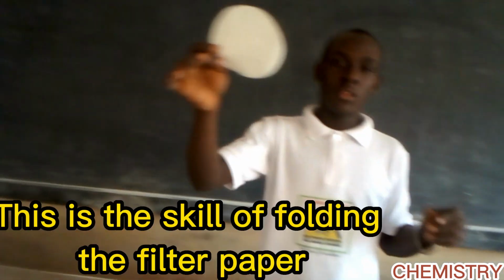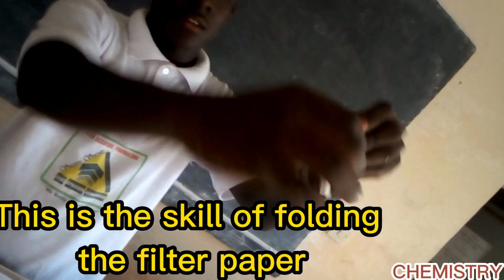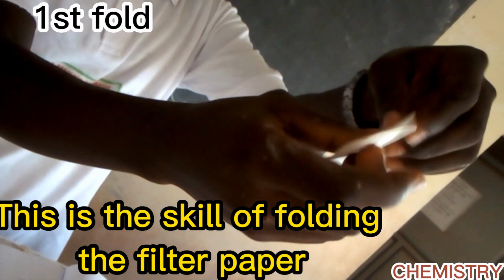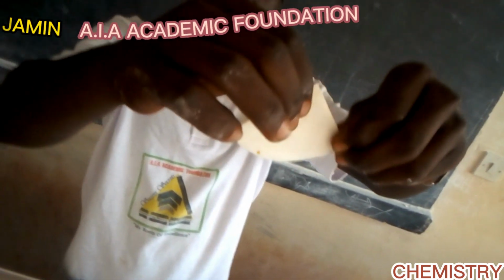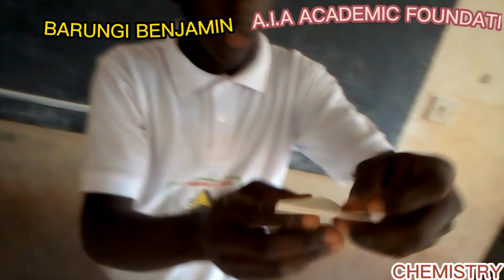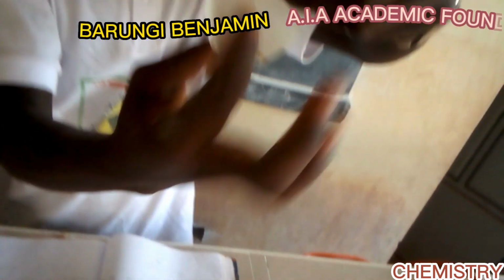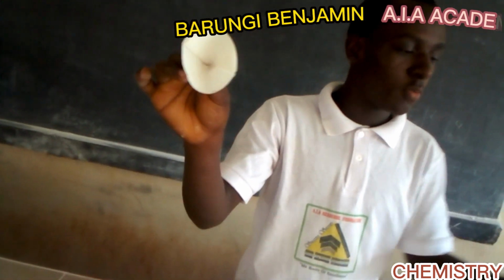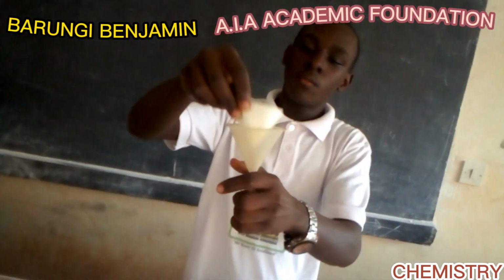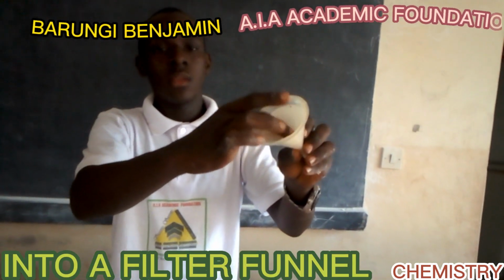We shall get our filter paper. This is the filter paper, and let me show you how to use it. You fold it like this. This is how they fold it. Then you fold it again like this, to make a cone. Then after folding it, you open one side like this, and then you're able to put it in the funnel, in that way.